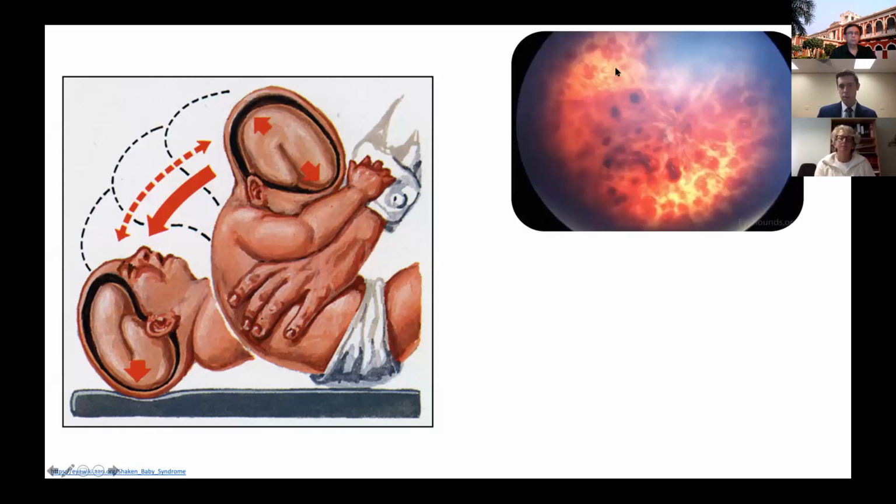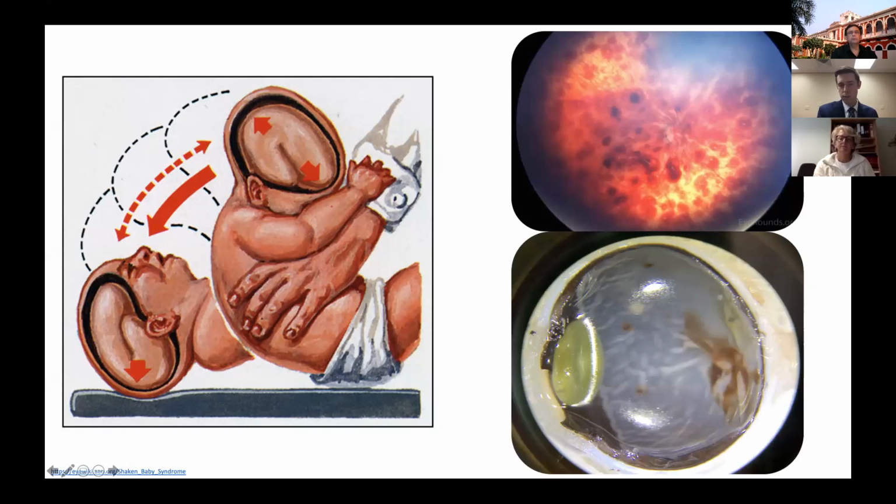This is actually from the University of Iowa in their Eye Rounds table, but all these hemorrhages are in all 3 layers, and you see almost this Roth spot appearance, and this you could truly say is too numerous to count. And then another gross specimen, just because I find these fascinating, and this was actually from my time with Dr. Potter in the pathology lab. We grossed in a non-accidental trauma case. The patient unfortunately passed away, but this was an 8-week-old little baby.